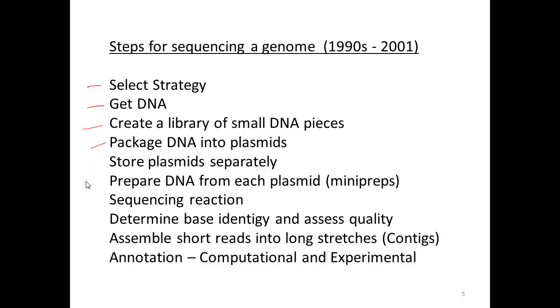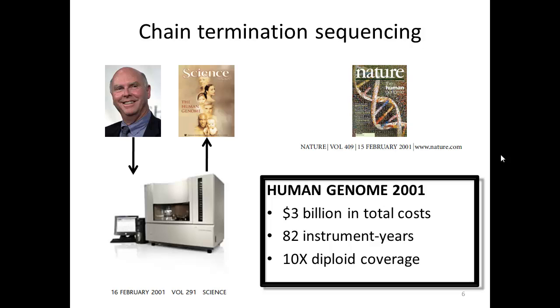Then when it comes time for sequencing, we're going to have to prepare DNA from each of those plasmids and do mini preps of the DNA. And then we'll do the sequencing reaction. Then we'll read out the bases and assess the quality. And then we're going to put those puzzle pieces together, the sequence reads together, into long stretches of contigs. And then finally, at the very end, we're going to annotate those sequences and identify where the genes are.